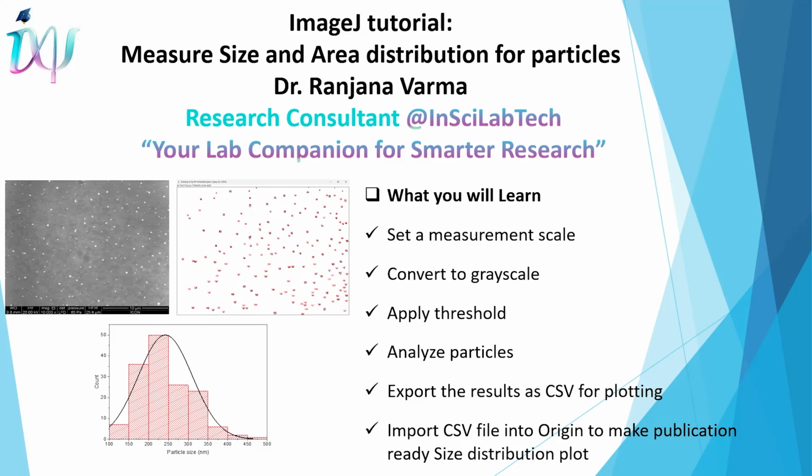As part of our For Researcher by Researcher initiative, I am here to show you how to measure size and area distribution for particles using ImageJ software. ImageJ is one of the most widely used free image analysis tools used by the researchers.